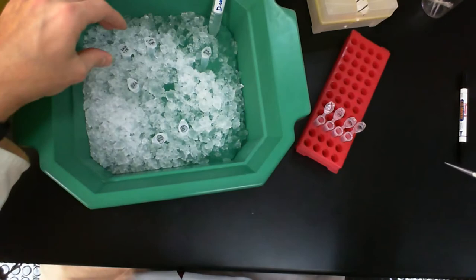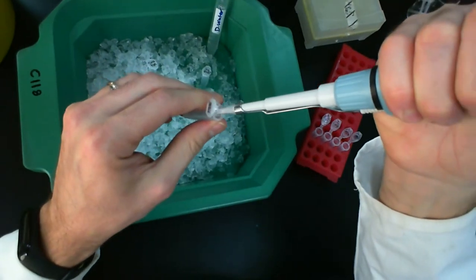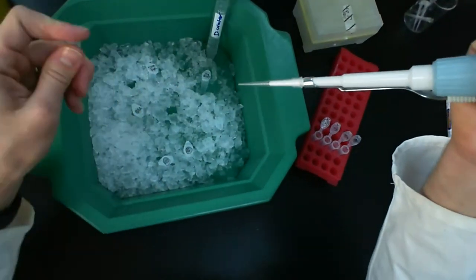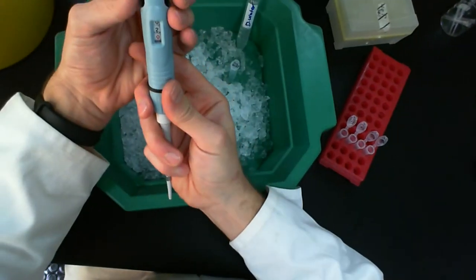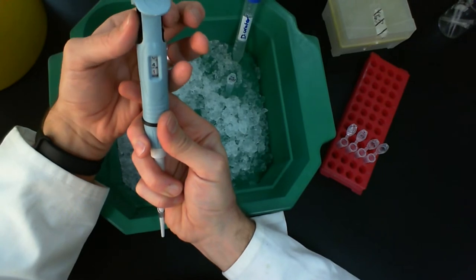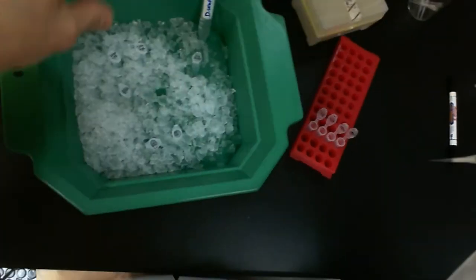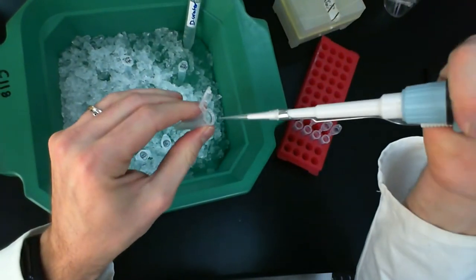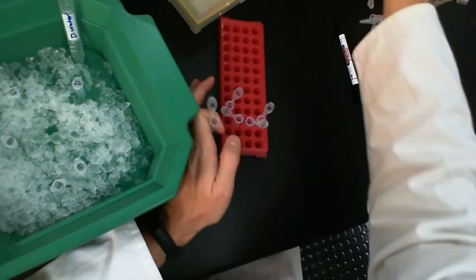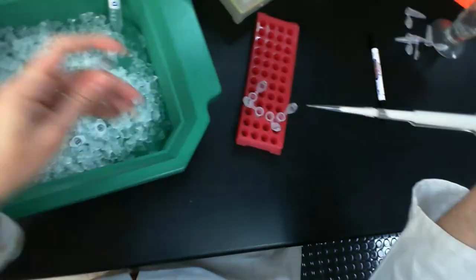And so I'm going to add the first DNA, DNA 1, into these samples. So tubes 1 and 2 get DNA 1. I'm going to take 2 microliters of that. Sorry, that one's supposed to be 4 microliters, so I should change the volume on this, shouldn't I? So let me change the volume to 4 microliters. Okay, 040. So here it is, 4 microliters. Add the DNA now. So 4 microliters goes into tube number 1. And okay, 4 microliters goes into tube number 2.